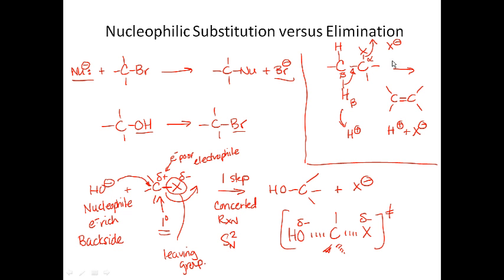And this can occur at high temperatures, which is what we're going to be doing by refluxing our solution for 45 minutes. So we can either get substitution or elimination, and these are the basic mechanisms for this. This would be called E2. Well, I don't know that it's E2, but this is a generic form of elimination that would occur for an alkyl halide at high temperatures.